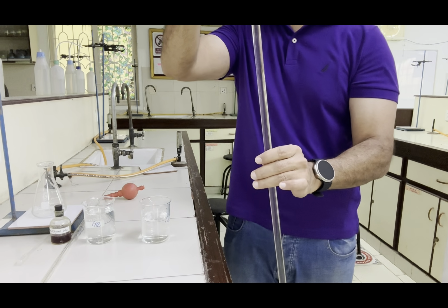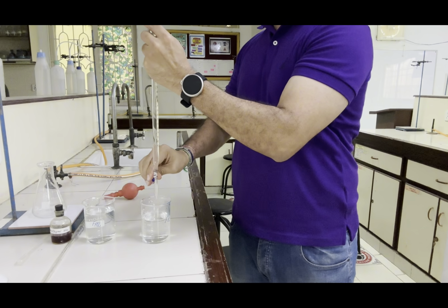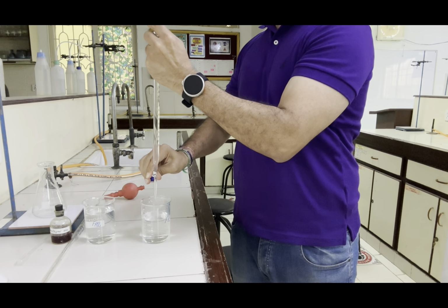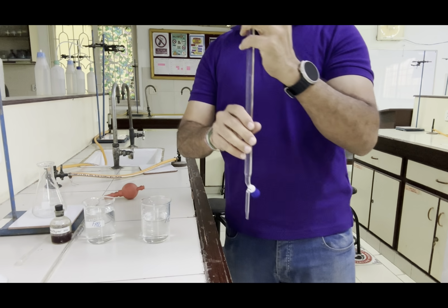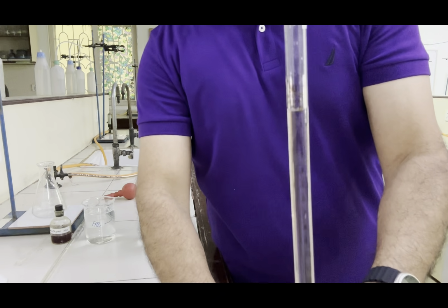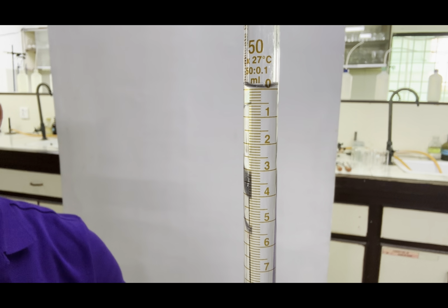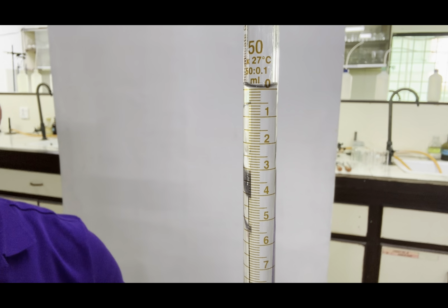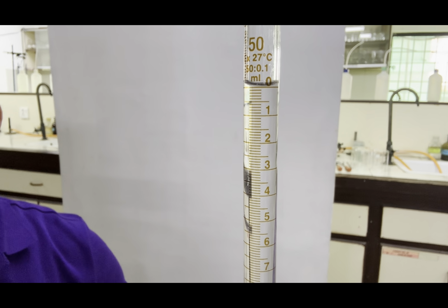If the solution gets a bit higher than that level, you can drain out a bit of solution. Now the mark is exactly 0. So this is our initial burette reading, 0.00.